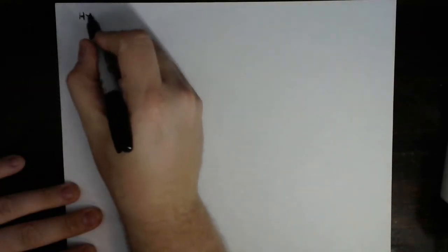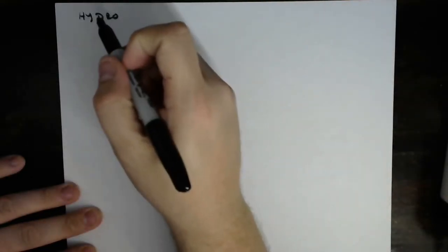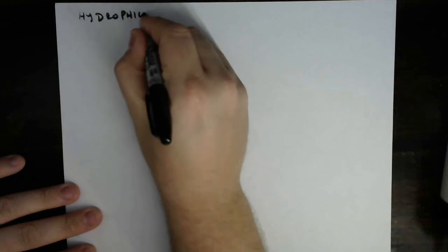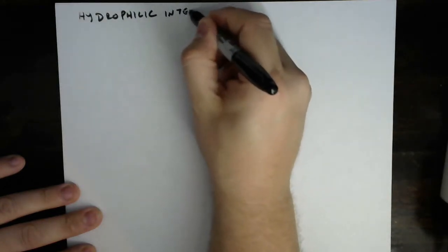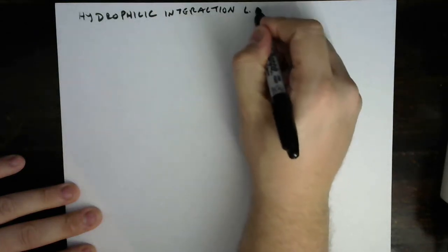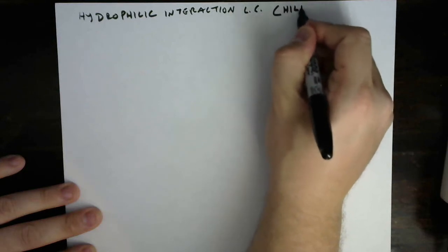All right, folks, last topic of the day is hydrophilic. Sorry, I think I've called this hydrophobic. It might just be a slip of the tongue. What we're trying to say is hydrophilic interaction liquid chromatography, or what is called in the literature HILIC, H-I-L-I-C.